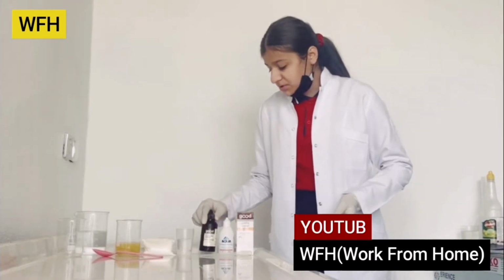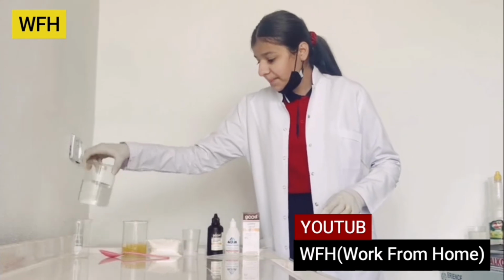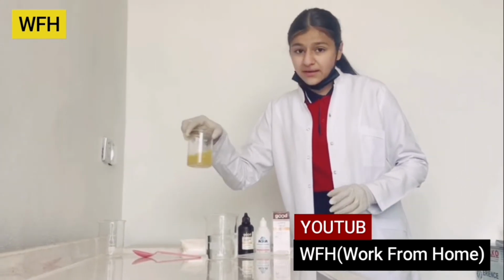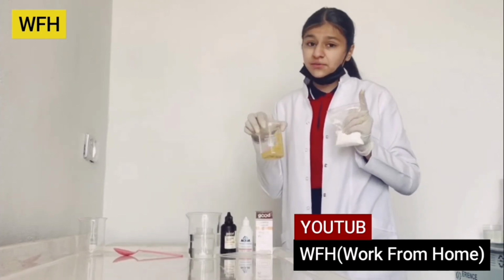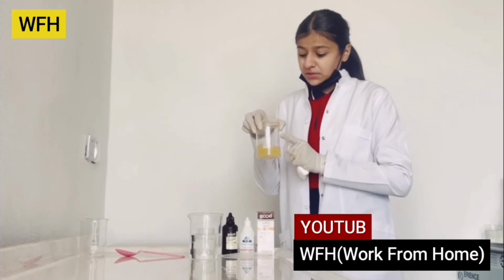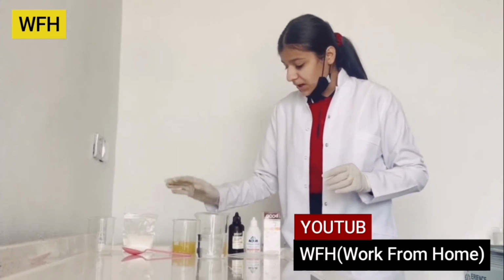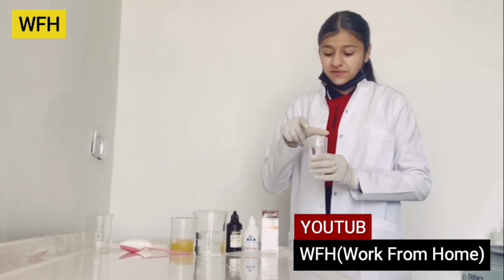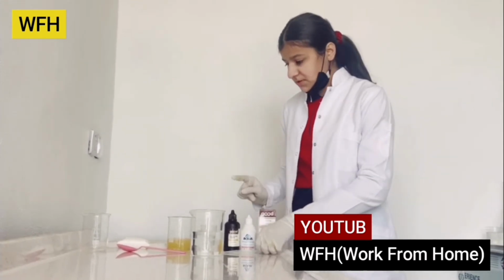So now I will start my experiment. My ingredients contain water in this beaker, citric acid. Here I have vitamin C. I can use vitamin C or citric acid. We can use both, but here I will use citric acid or lemon. We have lemon in this beaker. And then we have 60 milliliters of hydrogen peroxide, iodine, and a pipette.